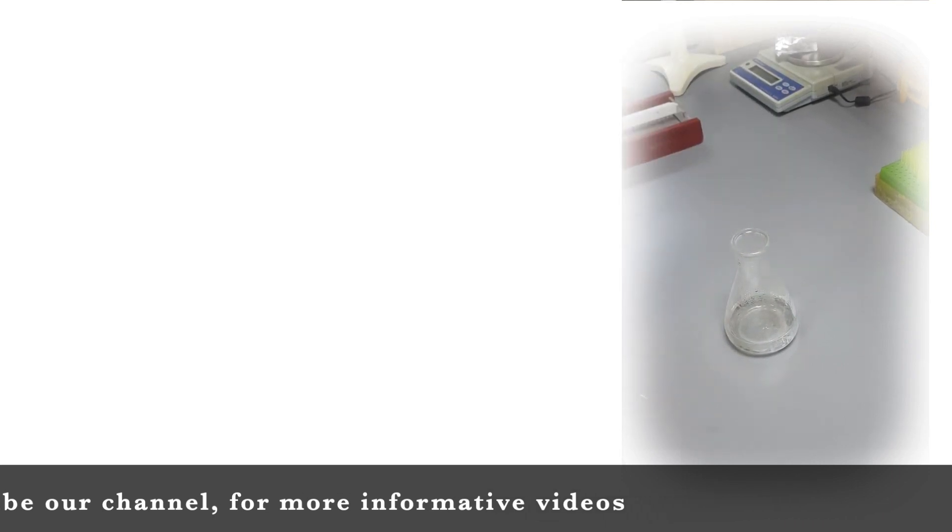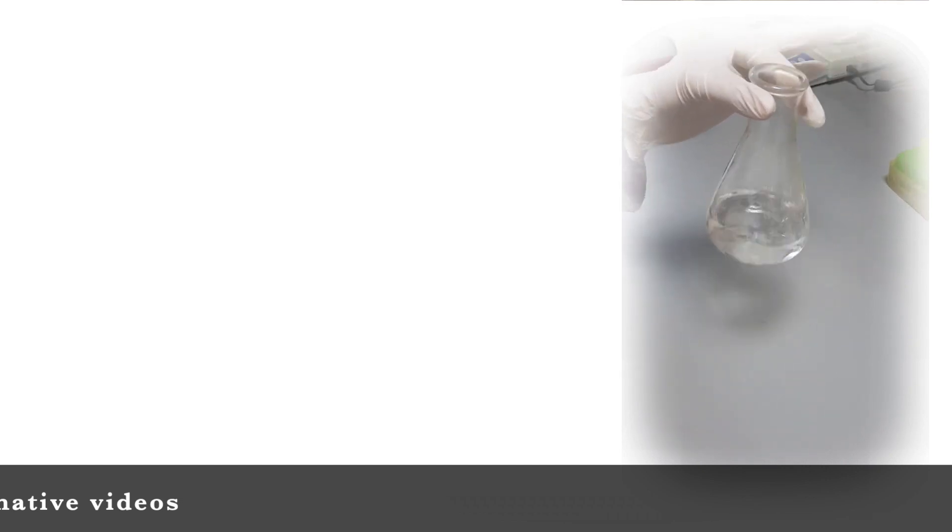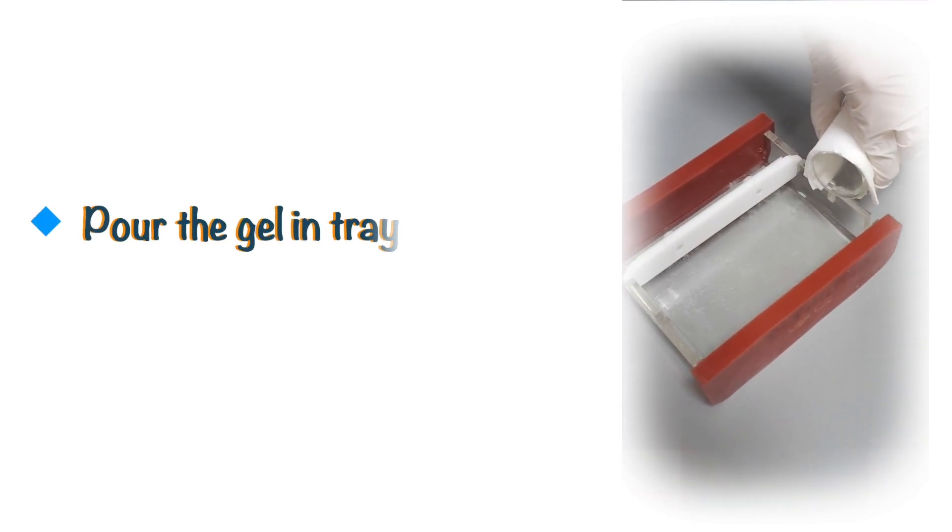Do remember that you only need to slightly cool down the mixture. If you leave it for a long time, it will solidify in the flask. After adding ethidium bromide in the mixture, pour it in the gel casting tray and let it solidify.